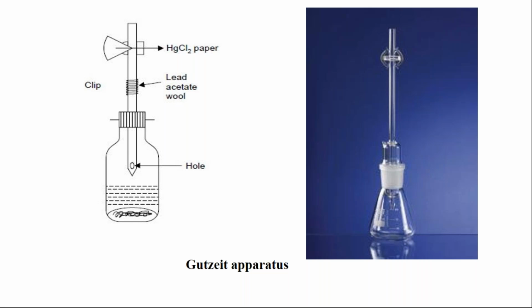So this bottle is fitted with a rubber bung through which a glass tube is passed. The length of this glass tube is 20 centimeters, and it has an external diameter of 8 mm and an internal diameter of 6.5 mm. The tube, as he said in the video, is constricted in the lower part, and it has a diameter of just 1 mm. Now, when they showed it in the video, the 2 mm hole was not visible.